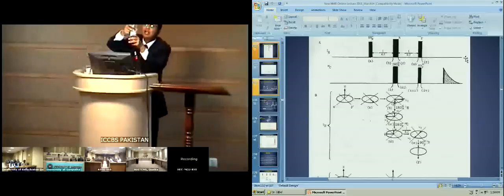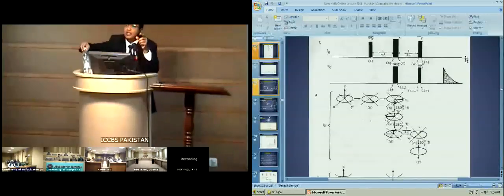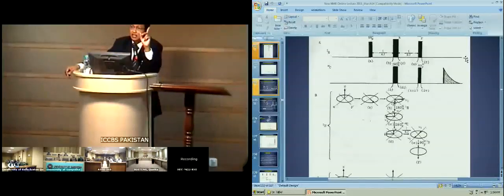Yeah, you can do that. I tried to do that also. The arrows which I showed you are the quantum transfer, forbidden and allowed quantum transfer. But it's not so easy to understand until you give them a number, 4 or 1 or 2. Quantum explanation of polarization transfer is not that easy. And I will tell you when we explain the NOE how allowed quantum transfer, single quantum transfer, double quantum transfer, forbidden quantum transfer work. Your wish for quantum transfer, I will fulfill.